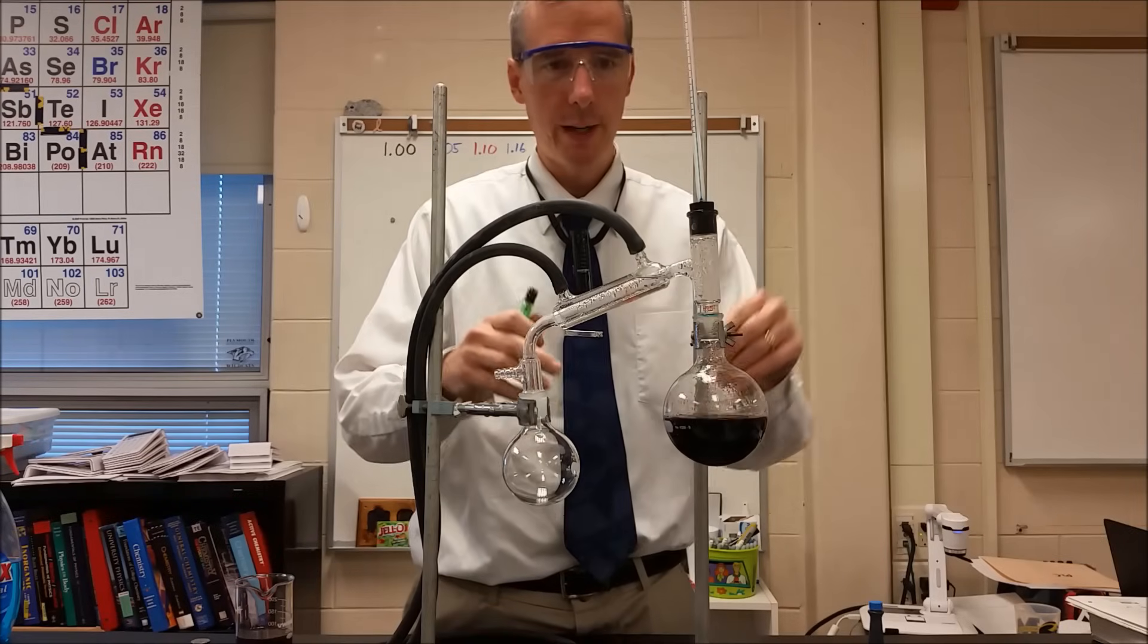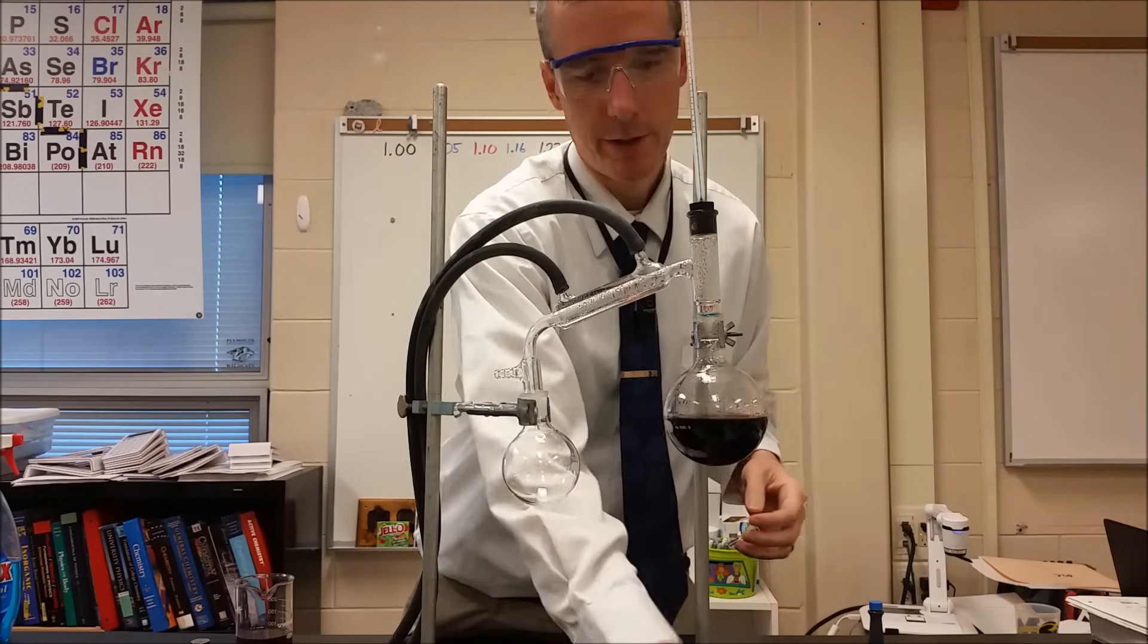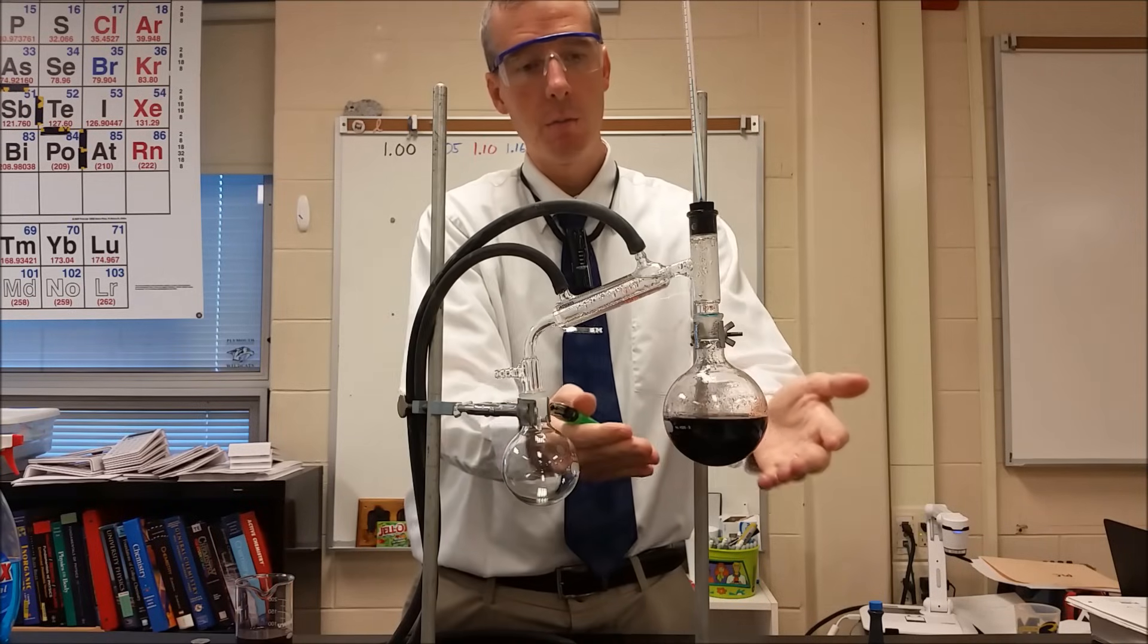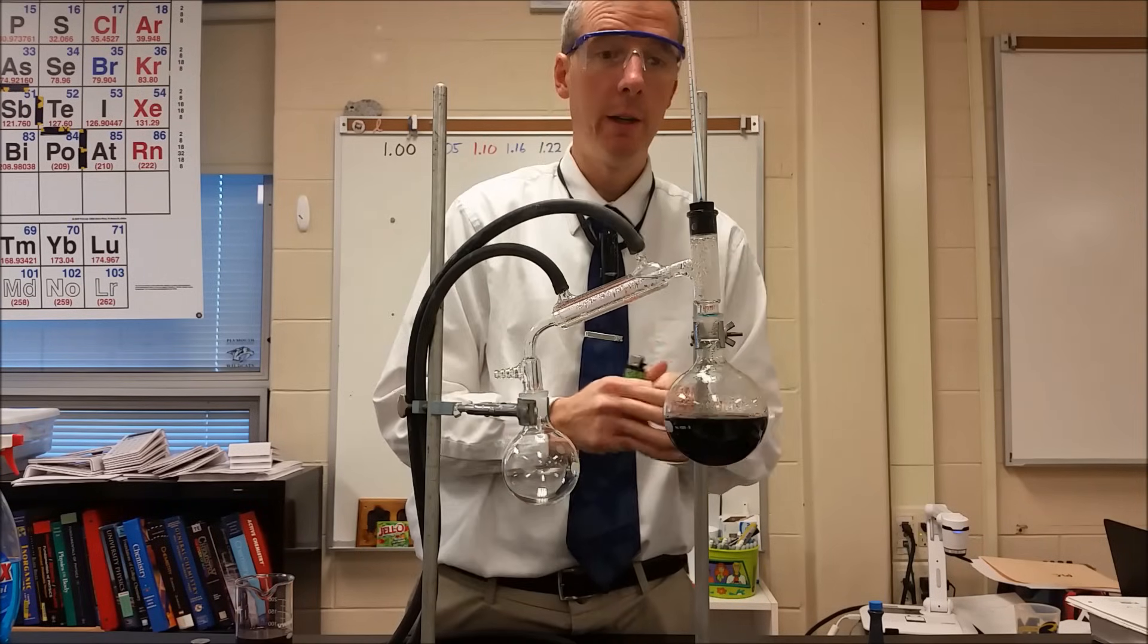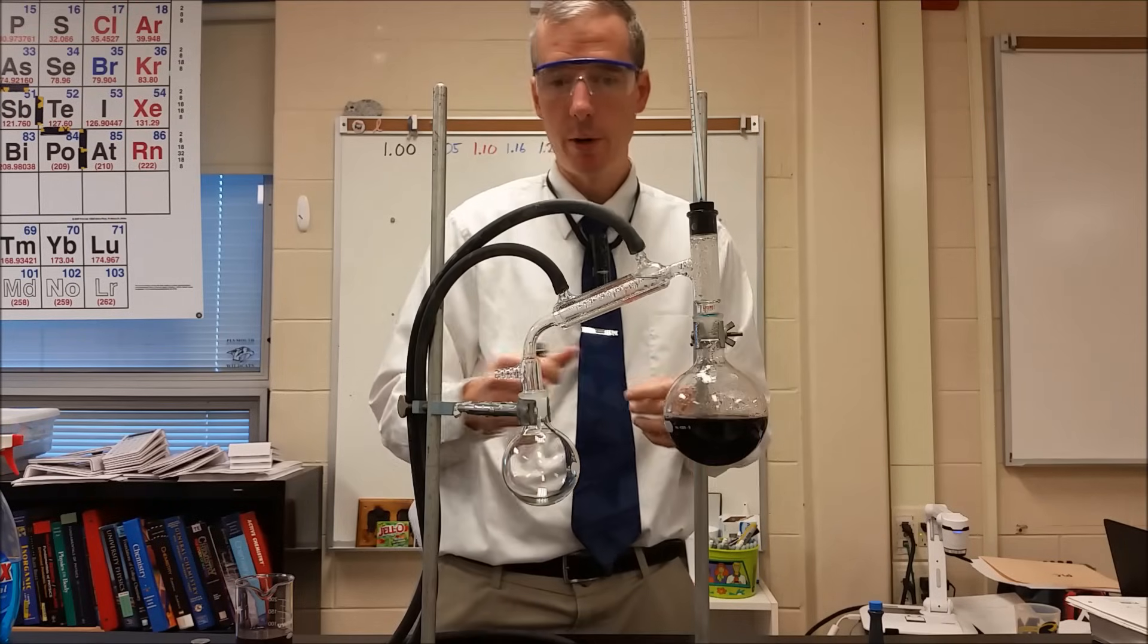This is a distillation apparatus. What we have here is a round bottom flask that has a mixture of water and food coloring in it, and we're going to heat it using a Bunsen burner.